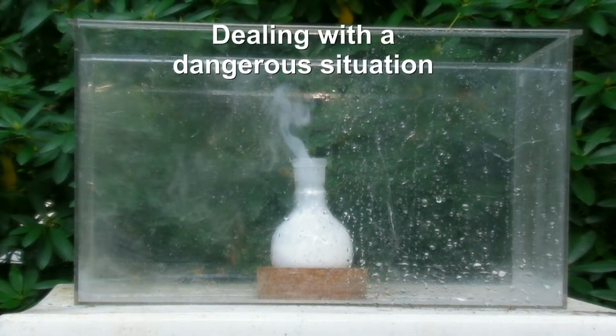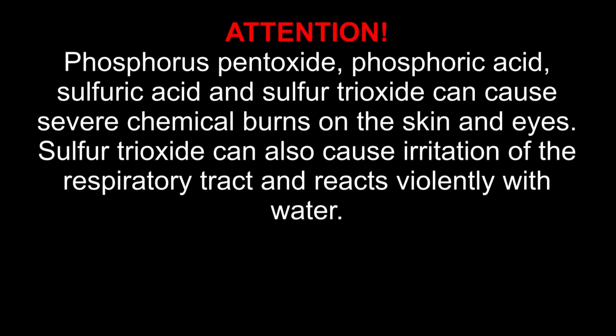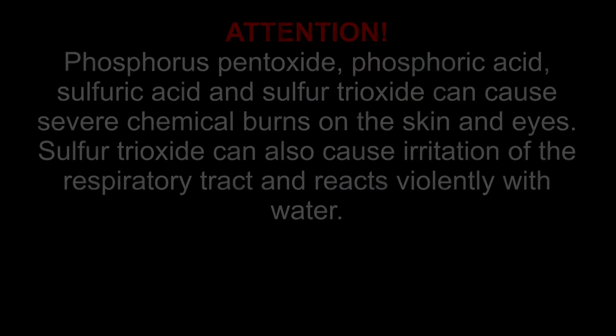Dealing with a dangerous situation. Attention! Phosphorus pentoxide, phosphoric acid, sulfuric acid and sulfur trioxide can cause severe chemical burns on the skin and eyes. Sulfur trioxide can also cause irritation of the respiratory tract and reacts violently with water.